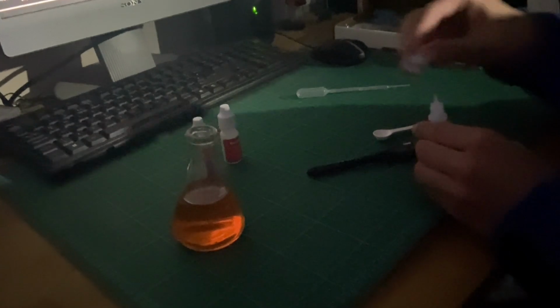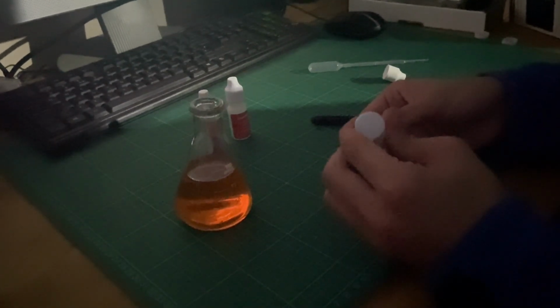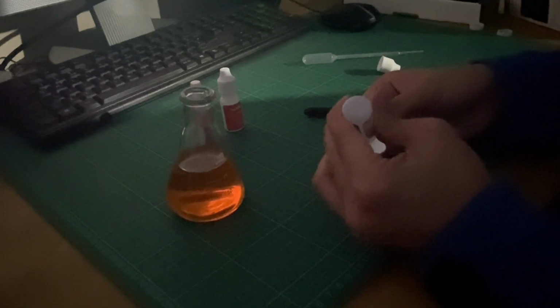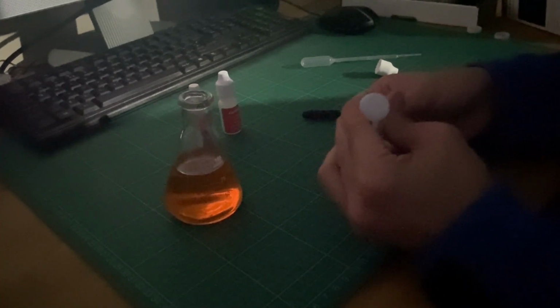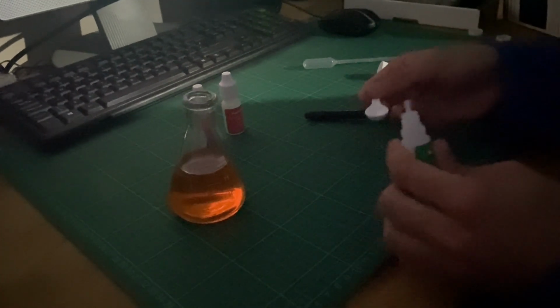Then we add NaCO3, or sodium carbonate, which deprotonates the COOH back to COO-. This is because NaCO3 is a base, while eosin, with a protonated COOH group, is an acid. As a result of this change, the yellow glow returns as the delocalized electron system is no longer disrupted.